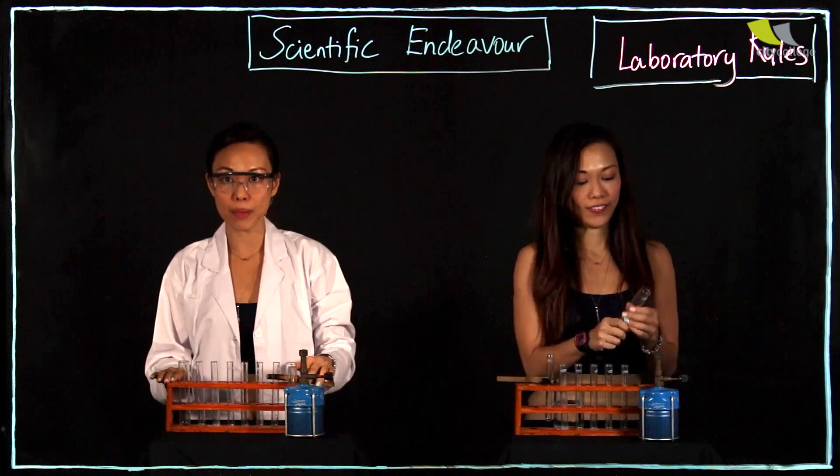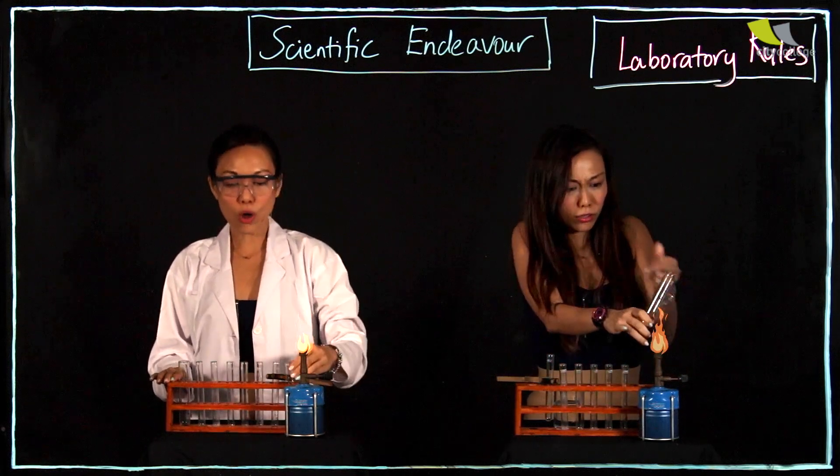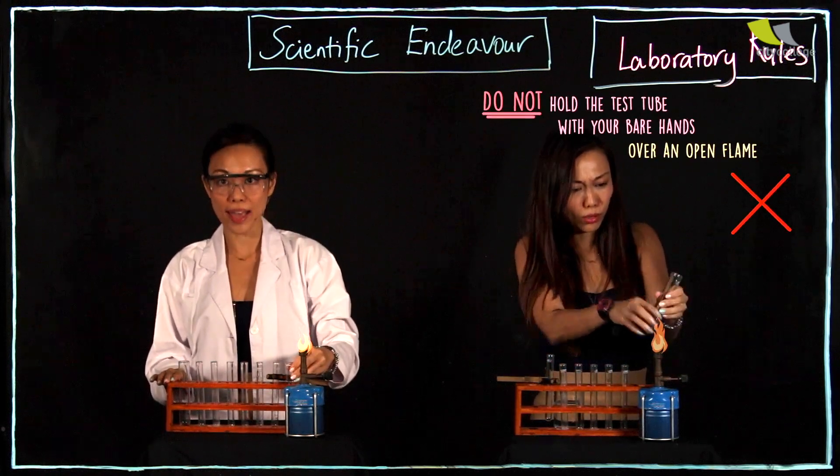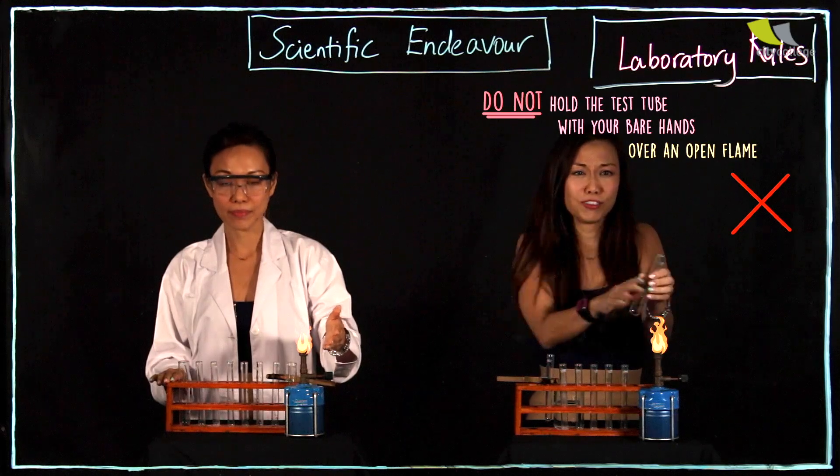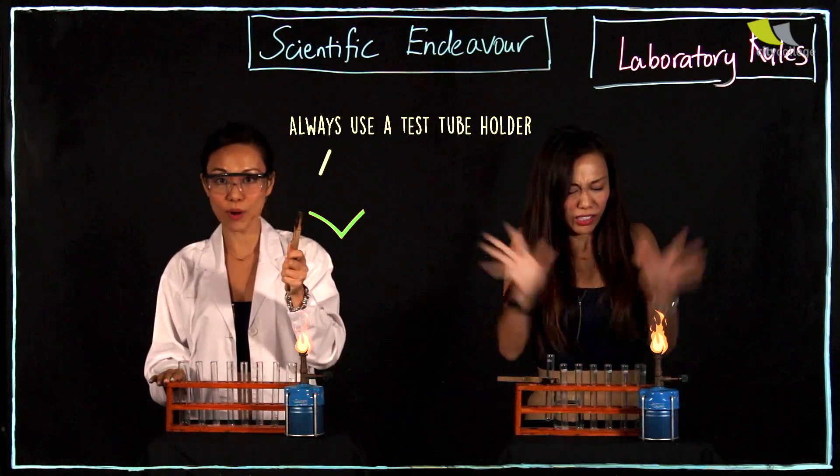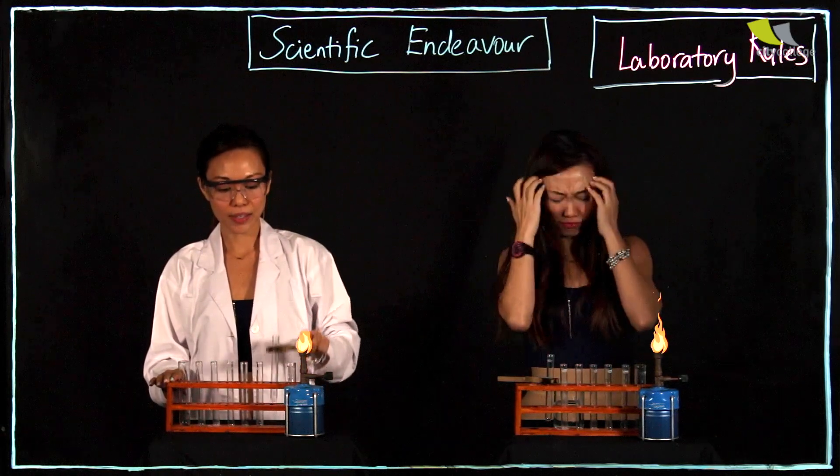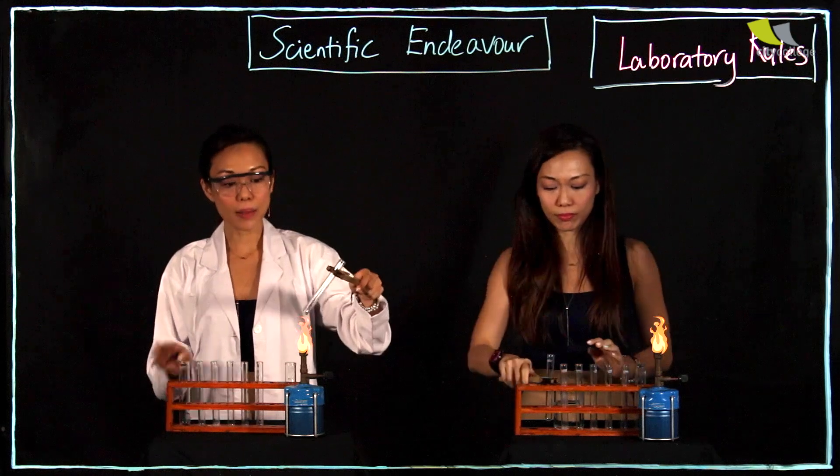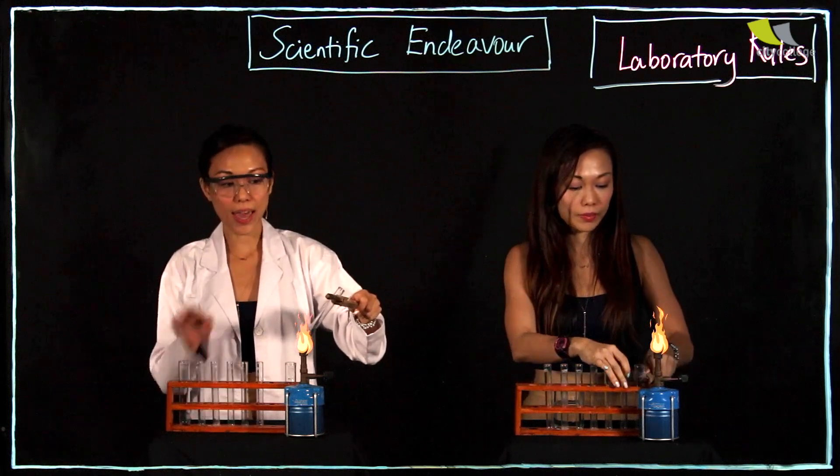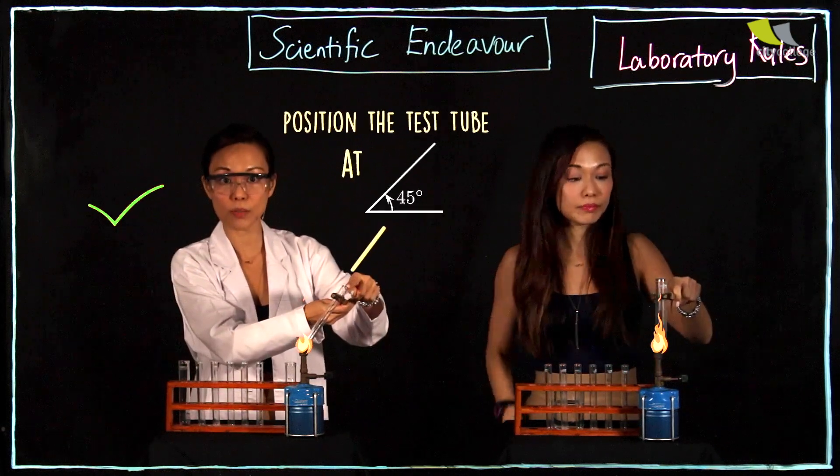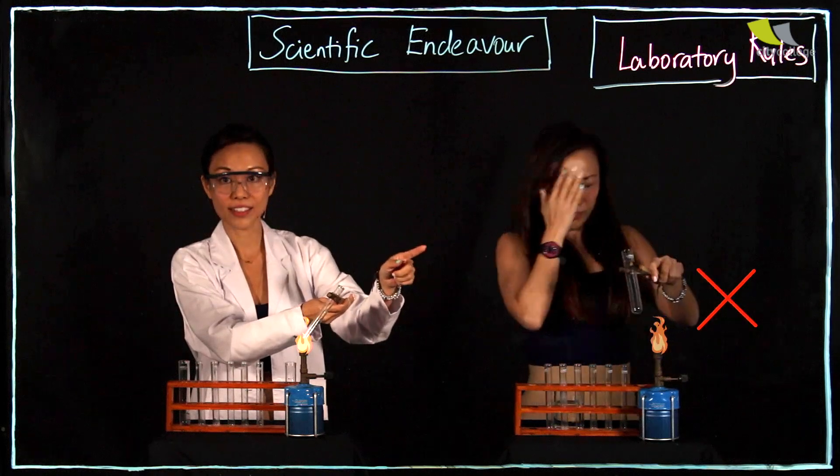Whenever you are doing heating, remember, do not hold the test tube with your hands over an open flame. Always use a test tube holder. And remember, place it at 45 degrees and ensure that the mouth of the test tube is not facing your friend or yourself.